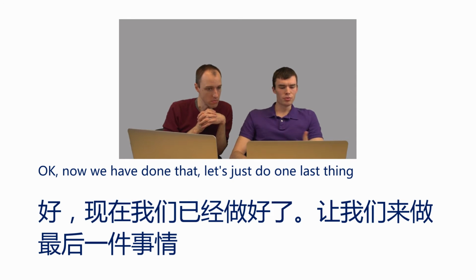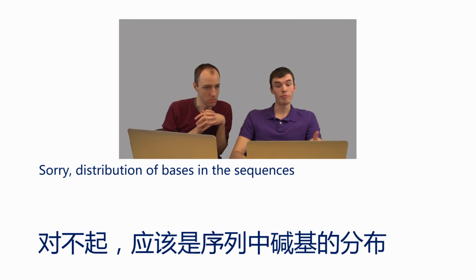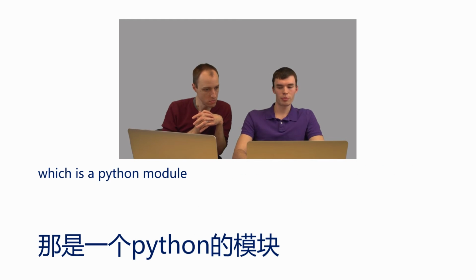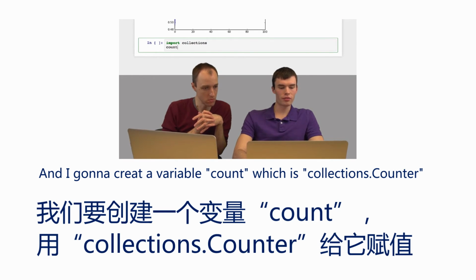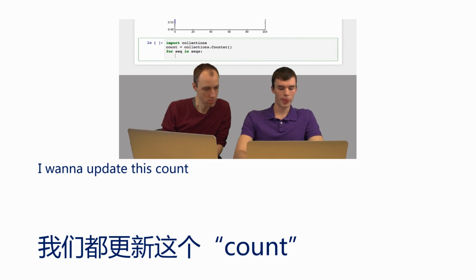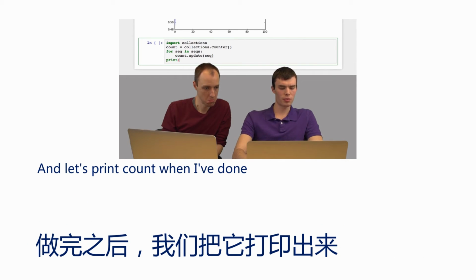Okay, now that we've done that, let's do one last thing. Let's look at the distribution of bases in these sequences. If you recall, in Practical 2, we used collections to do this, which is a Python module. So let's do that again. We're going to import collections. I'm going to create a variable count, which is collections.Counter. Now for each sequence in our list of sequences, I want to update this counter, so I'm going to do count.update and pass in a string, which in this case is just the sequence of bases. And then let's print count when we're done.